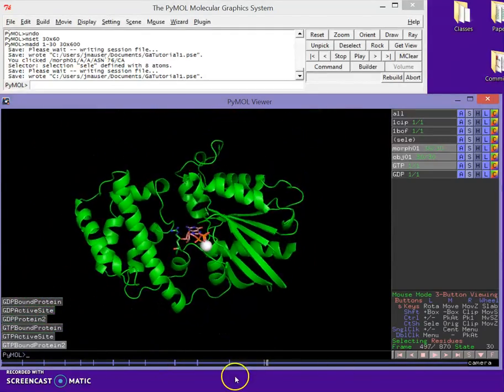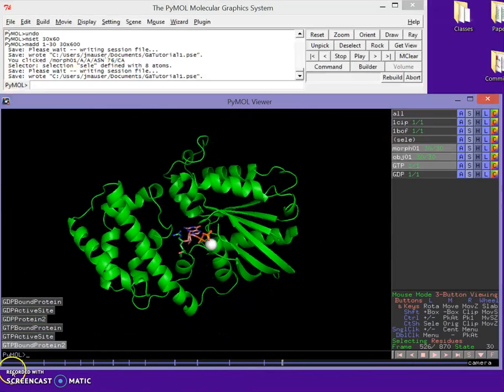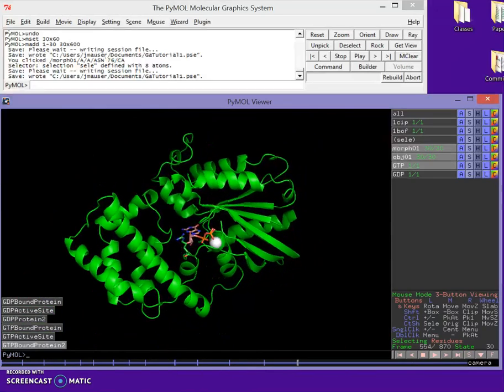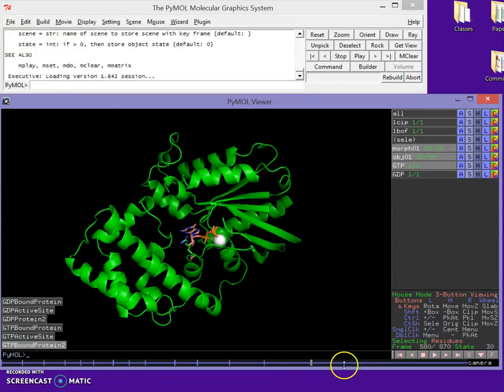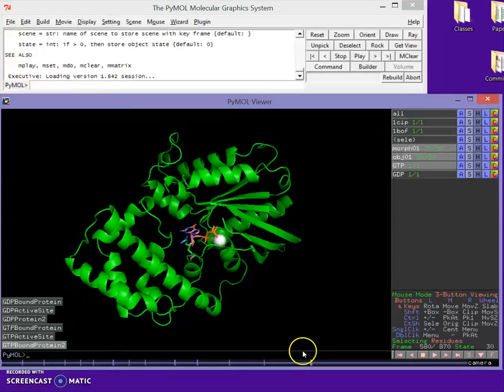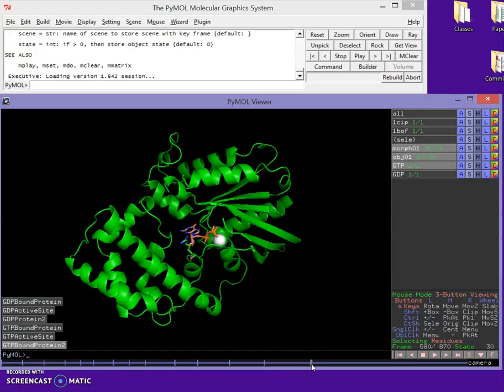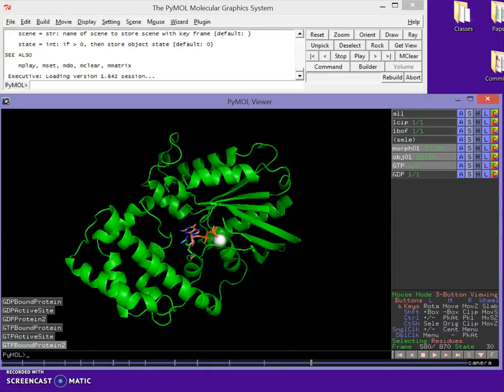And then it's going to try to loop around, so it has this little bit of a wiggle. So what we're going to do now is we could do the old way with the insert a Y roll, but that's going to cause us to lose our state ideal. And so it's going to kind of screw our movie up.